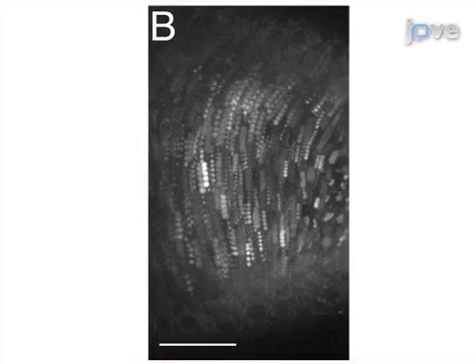Ultimately, a time-lapse sequence of the images generated can be used to monitor the movement of proteins or particles in living cells over time. This method can help investigate key areas in cell and developmental biology, such as protein and mRNA trafficking and the establishment of cell polarity.